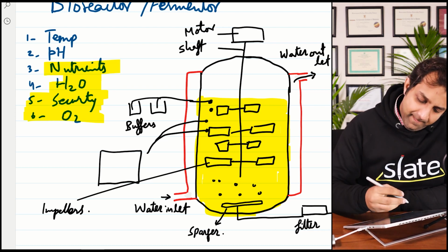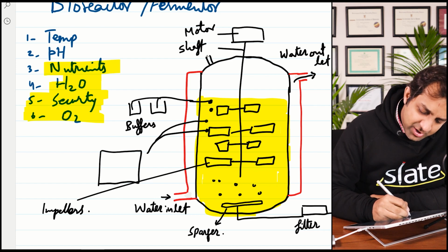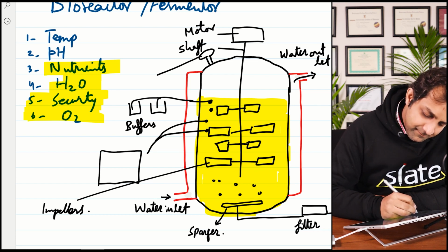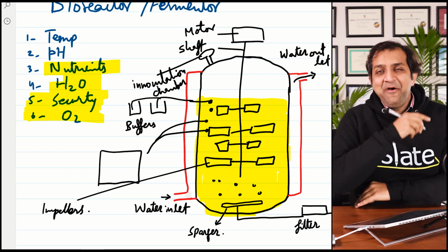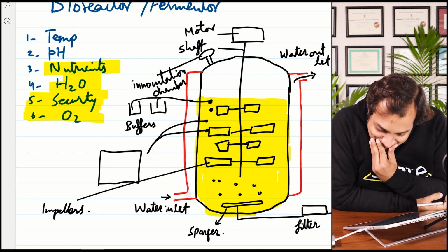Acha. Then here we have an inoculation chamber.